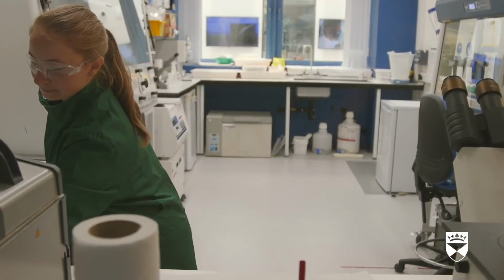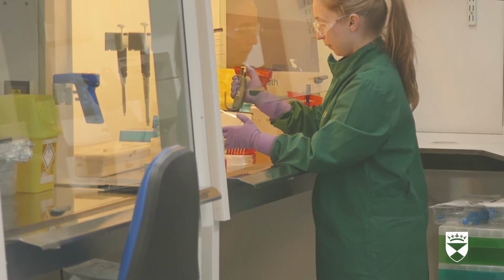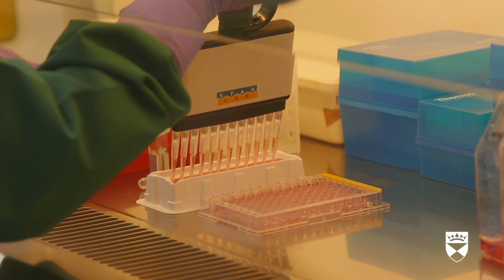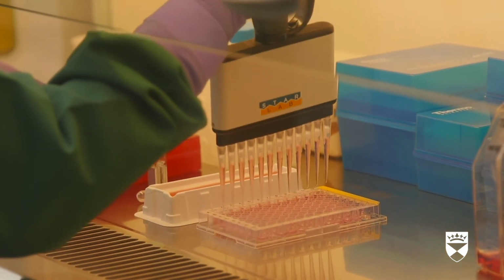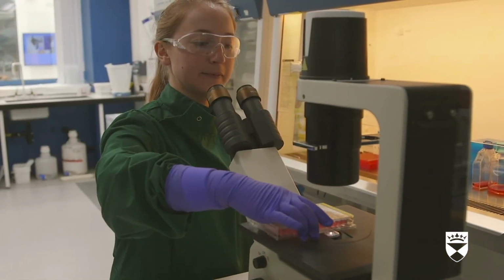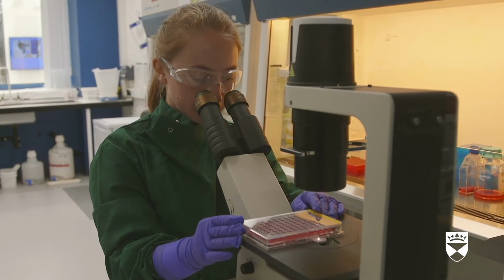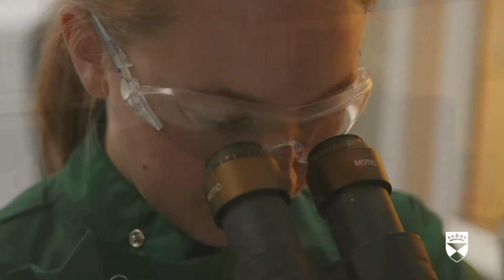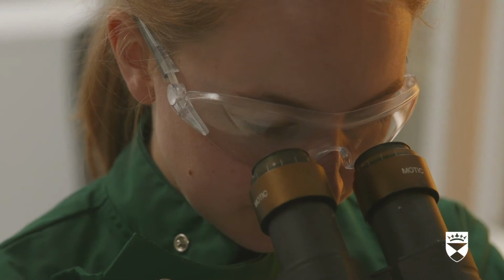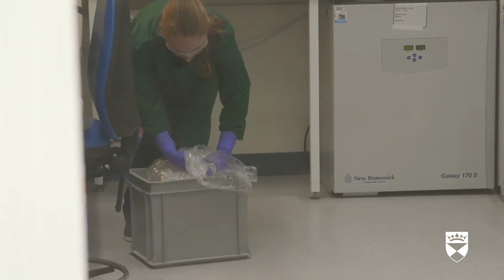After 6 hours, we add a medicine to kill the parasites. Any parasites that have the synthetic DNA sequence will have become resistant to the medicine. They will survive an increase in number over the next few days. We check any live parasites under the microscope and take a sample of their DNA to check if the synthetic DNA is present.